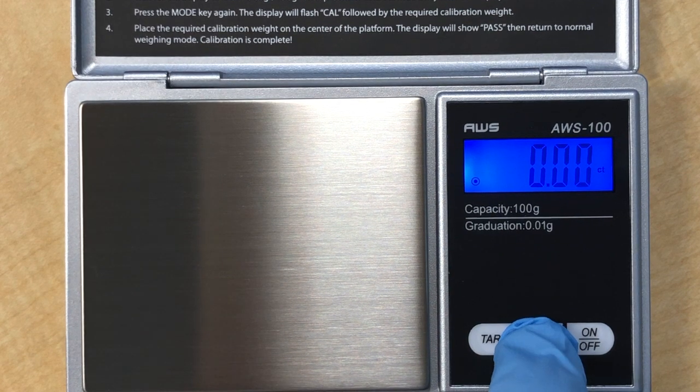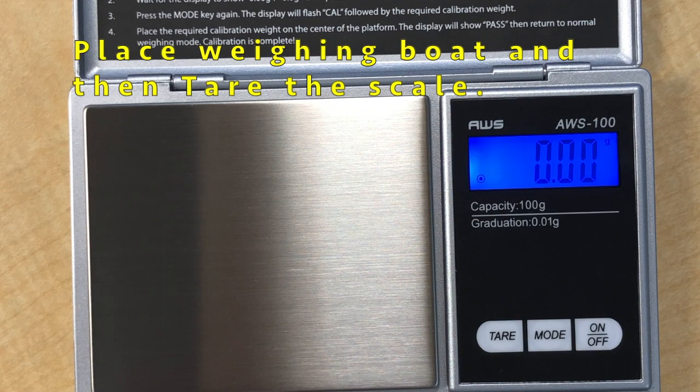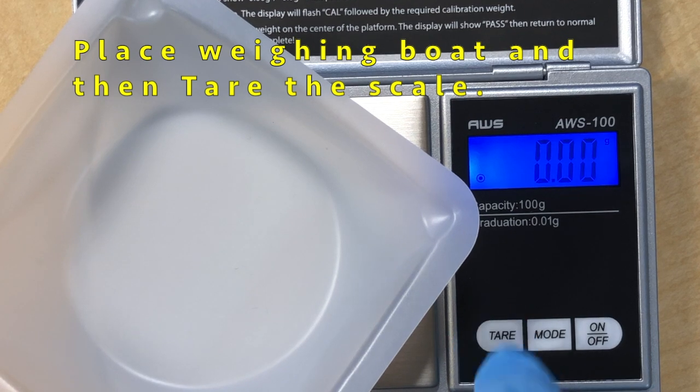We set the scale to grams, put the weighing bolt and then tear it. Tare means that the scale is set to zero so that the weighing bolt will have no mass when the nuts are placed.